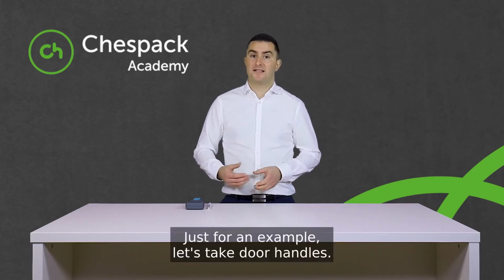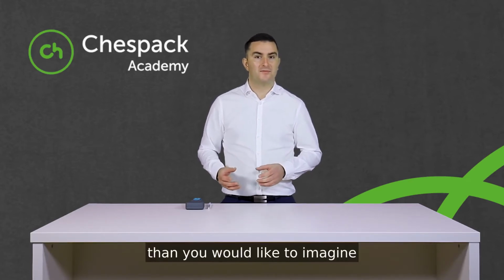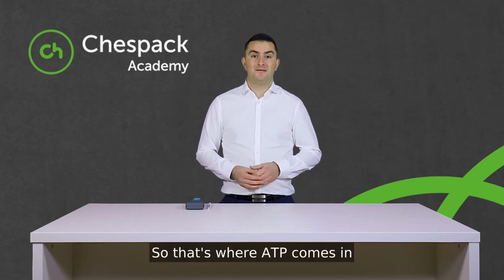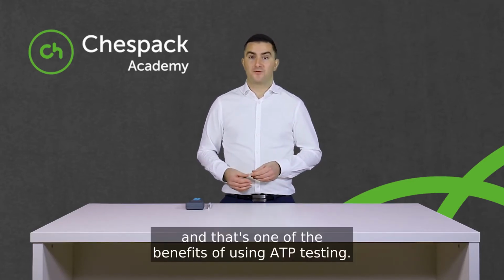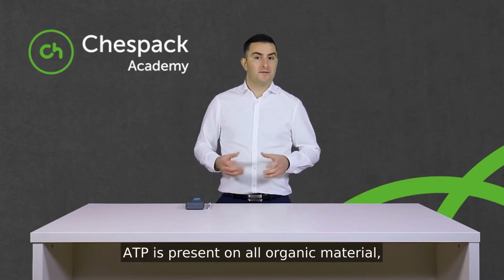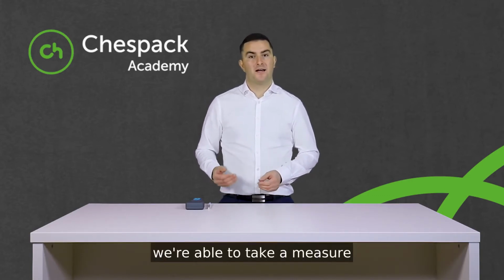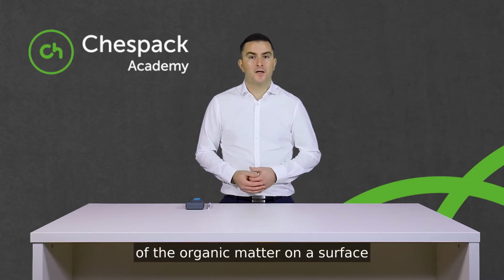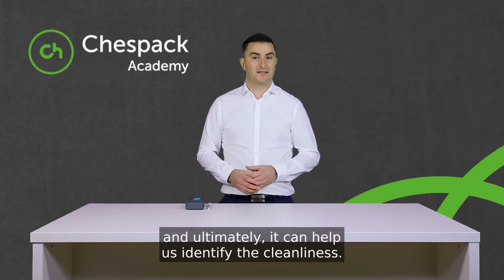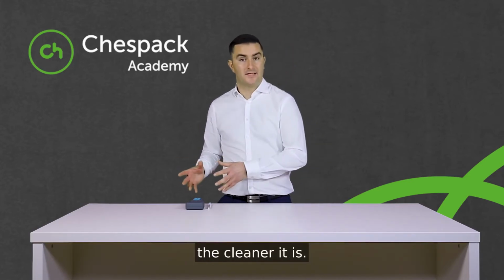Just for an example, let's take door handles. They're far, far dirtier than you would like to imagine, but you wouldn't think so just by looking at them. So that's where ATP comes in, and that's one of the benefits of using ATP testing. ATP is present on all organic material, so by using swabs we're able to take a measure of the organic matter on a surface, and ultimately it can help us identify the cleanliness. The lower the organic matter on the surface, the cleaner it is.